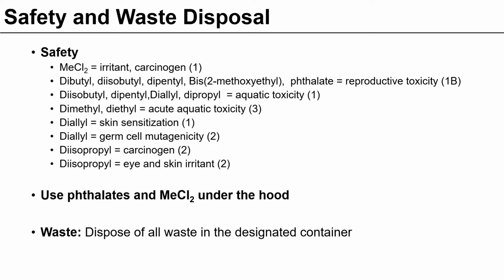Make sure that we're not getting these all over the place. One thing that I neglected to mention is that some of these compounds are going to be crystalline solids. Others are going to be liquid at room temperature. So when you're adding these to your standards, if it is a liquid, you're going to have to use an appropriate delivery mechanism and not be spilling that all over at the balance. All right, and we are going to have a special waste container for this.